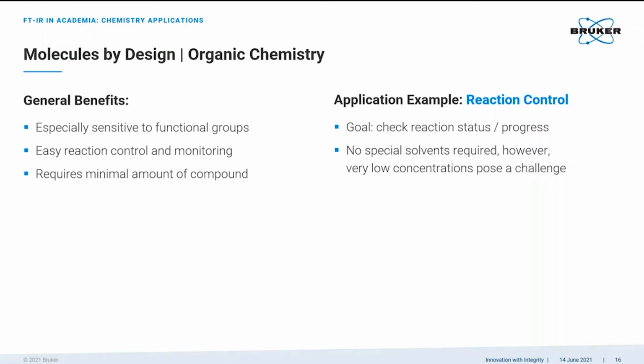This works great in the normal concentration range, but can go somewhat challenging when very low concentrations have to be measured under the excess of side products. In these cases, however, a few drops of the reaction mixture can be evaporated on the ATR crystal. There are heated options that simplify this for solvents like water or similar.